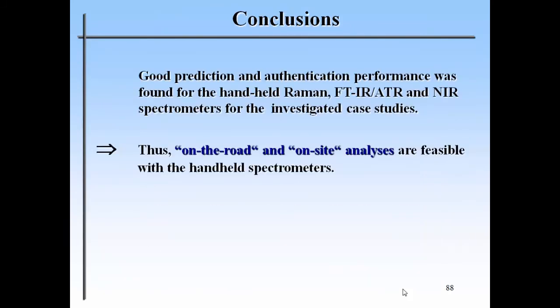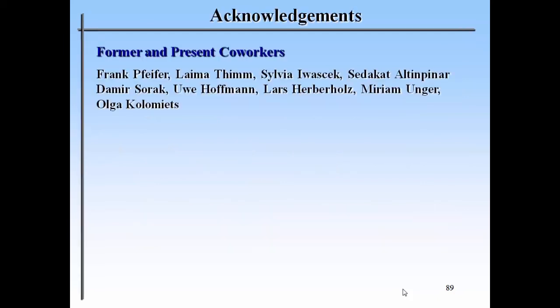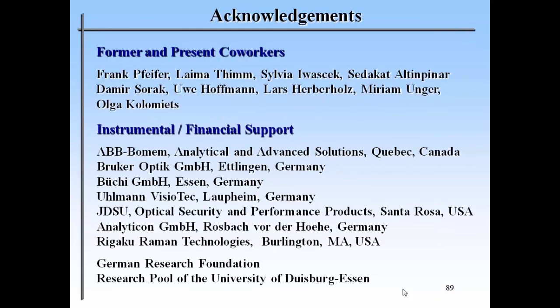Conclusions? I hope I have shown you that it is possible to use these small or handheld instruments for on the road, on-site analysis, and generally these handheld spectrometers provide an excellent, at least alternative to laboratory instruments for qualitative and quantitative chemical quality control.